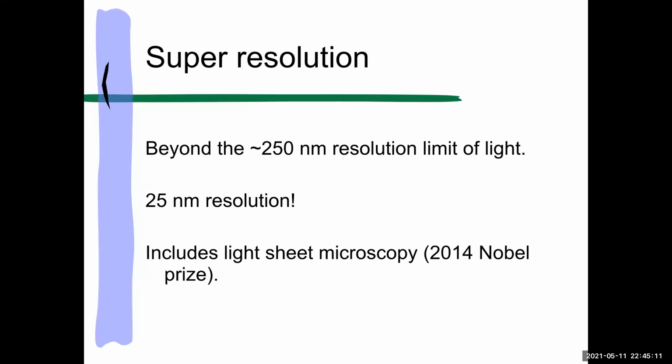I've been telling you this whole time, there are different microscopy techniques, and no one scope solves them all or has it all. Don't just use a confocal just because it's the best. There's a place and time for wide field. There's a place and time for DIC. There are all these different scopes and different techniques. You can't just have one scope. Eric totally acknowledged that, and said, but now I'm going to make it so you can have one scope. He's trying to put 14 different techniques on one scope, which he calls a Swiss Army knife scope.